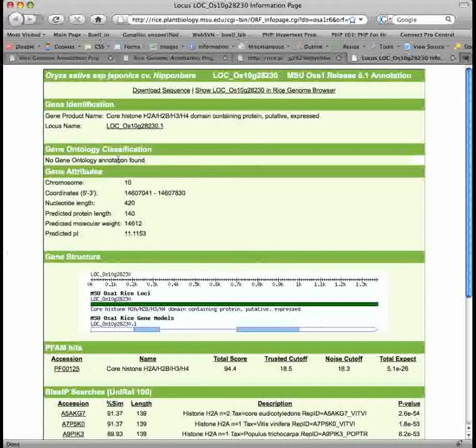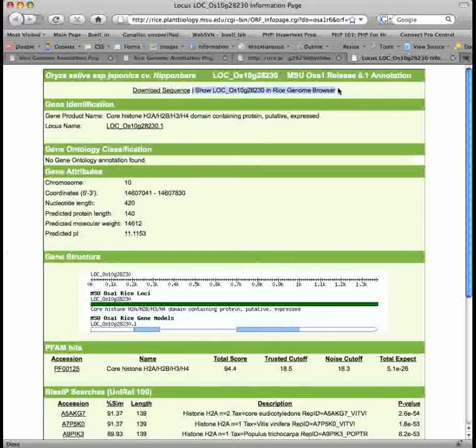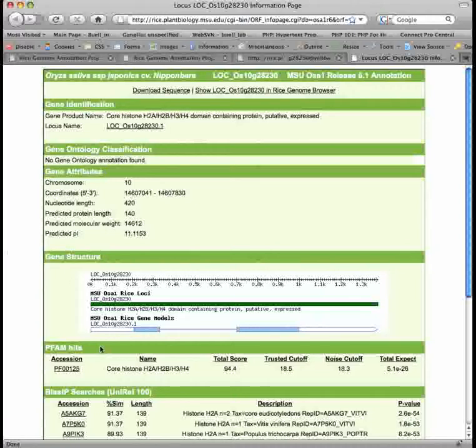On the gene report page, you will see the name of the locus, links to download the sequence, and a link to return home to the genome browser, gene identification information, gene ontology classification, gene attributes, gene structure including locus and gene models, PFAM domains, and BLASTP search results against UNIREF 100.